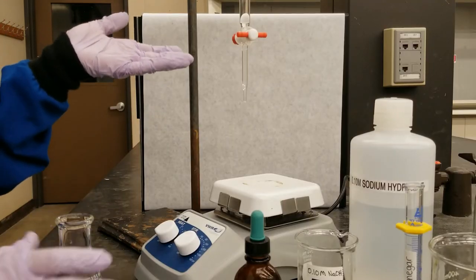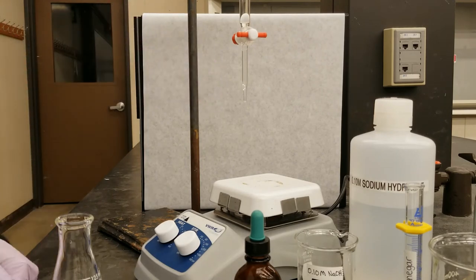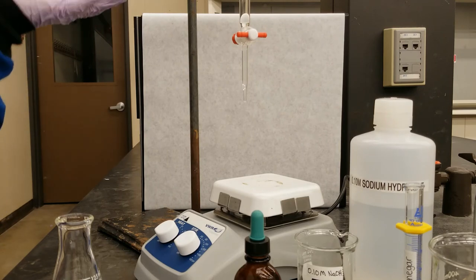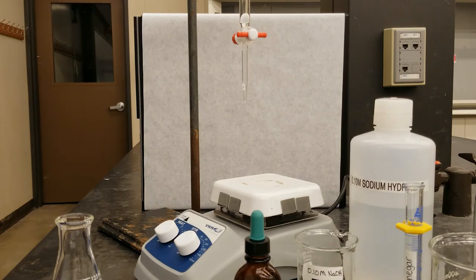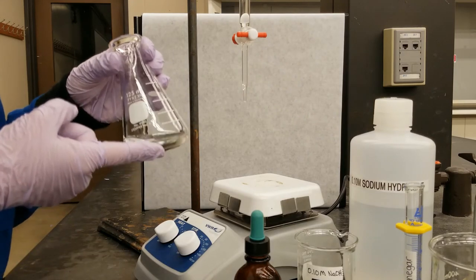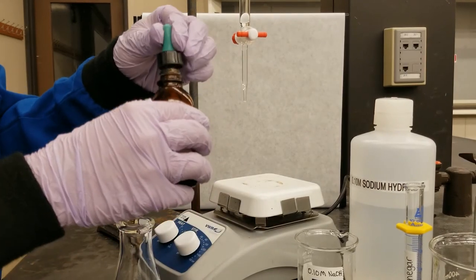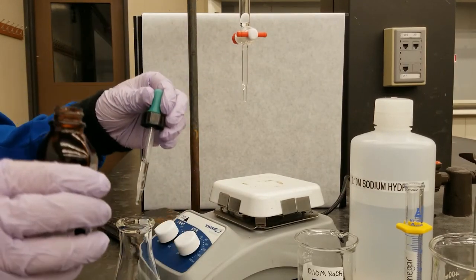So for our second trial, I filled up our sodium hydroxide solution in our burette. And just as a note, you do not have to start at zero. For example, in my second trial, I started at 2.4 mils. Before we get started, I have already added my vinegar and water to the Erlenmeyer flask. So now I'll add my 5 drops of phenolphthalein, my indicator solution.